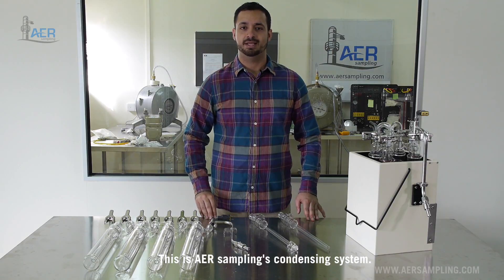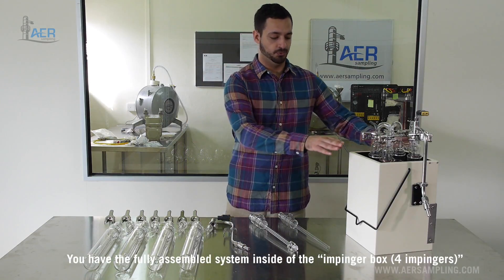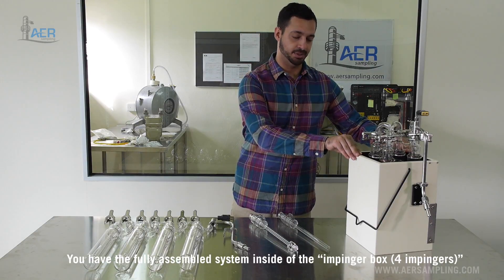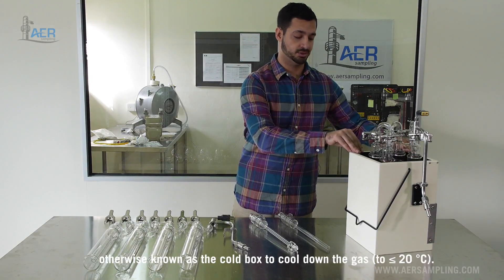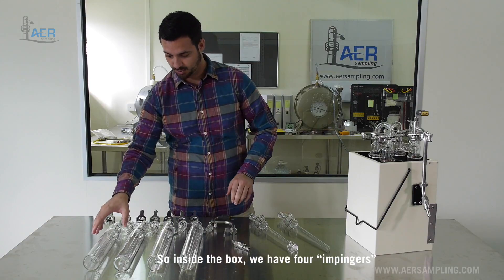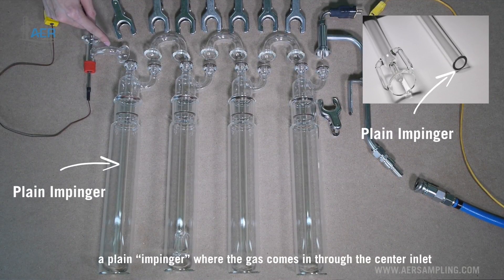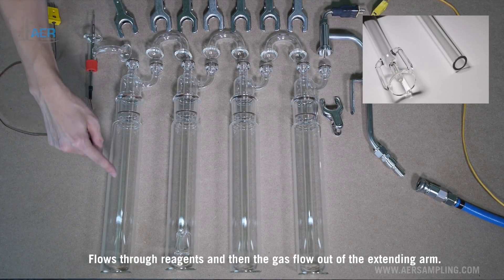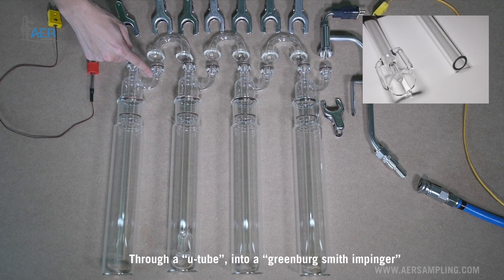This is AER sampling's condensing system. We have the fully assembled system inside of the impinger box to cool, otherwise known as a cold box, to cool down the gas. Inside the box we have four impingers. A plain impinger where the gas comes in through the center inlet, flows through reagents, and then the gas flows out of the extending arm.